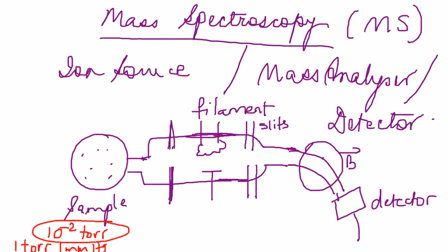One common procedure of ionization is that you take a high energy beam of electrons and you separate out the ions by focusing the ions in a beam which is then bent by a magnetic field. So what is done is you allow these particles to come through a repeller electrode. So this is where your electrode is. That's your electrical field. And you allow them to pass through this filament and accelerate through the accelerating slits. And then that is subjected to the magnetic field.